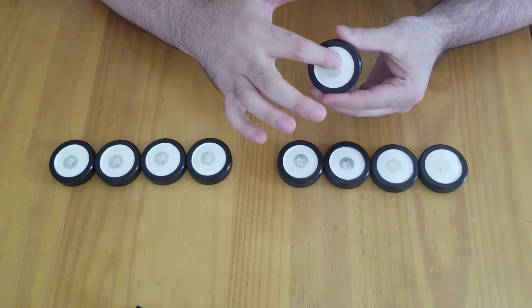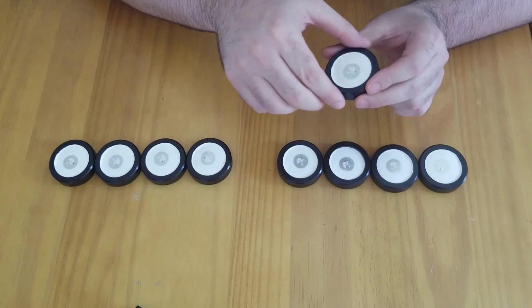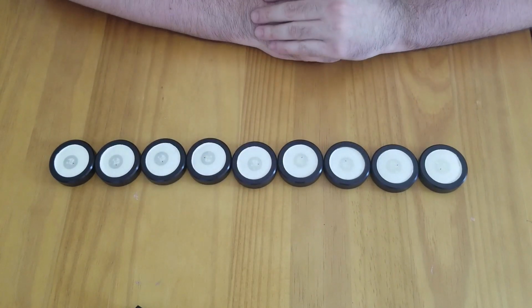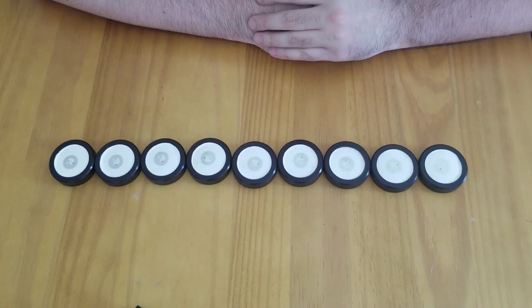This silver sticker is an RFID tag, which is attached to the cardboard backing of each sample cup. The RFID tag contains all of the sample information, including sample name, product type, and any additional sample information. They're small, easy to handle, and reusable.